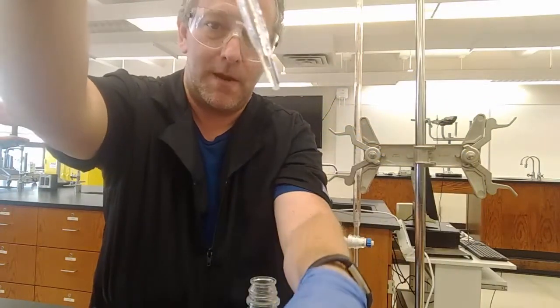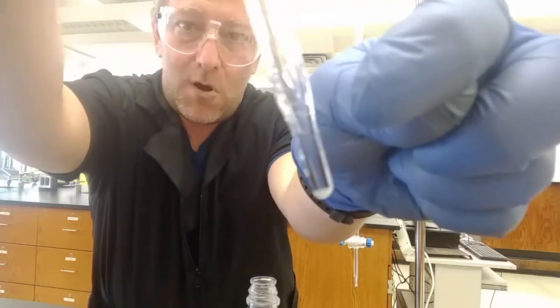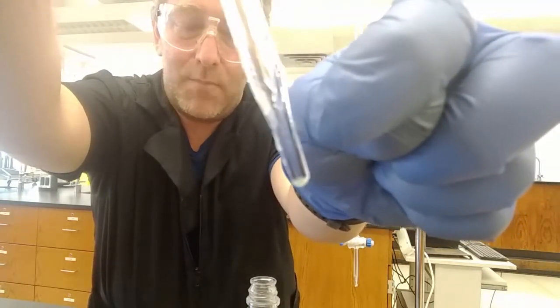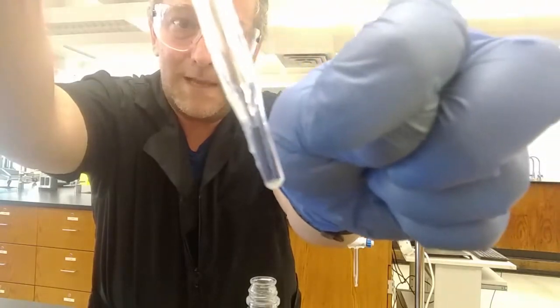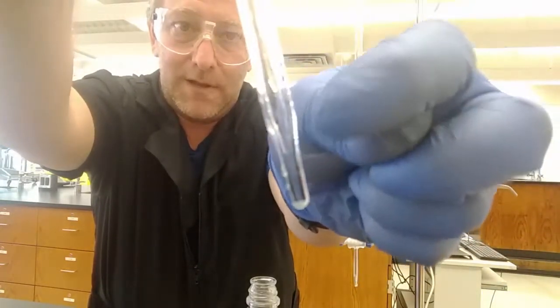But there is, in the pipette, you can see, a small amount remaining. It has delivered the 10.00 milliliters plus or minus 0.02 milliliters exactly. There's no bulge, nothing hanging off the tip. This is exactly delivered 10 milliliters.